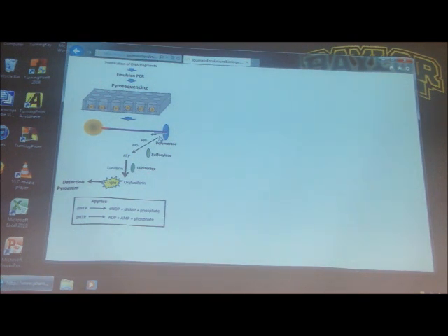We take a dATP. How many phosphates are we going to keep to make the phosphodiester bond? One. Just one. Good. So what is released? Two phosphates. And what's the name of that? Pyrophosphate. Exactly. So the pyrophosphate is released. Of course, it's very active. And then we use sulfurylase, and that will release energy from the pyrophosphate and capture it as ATP.